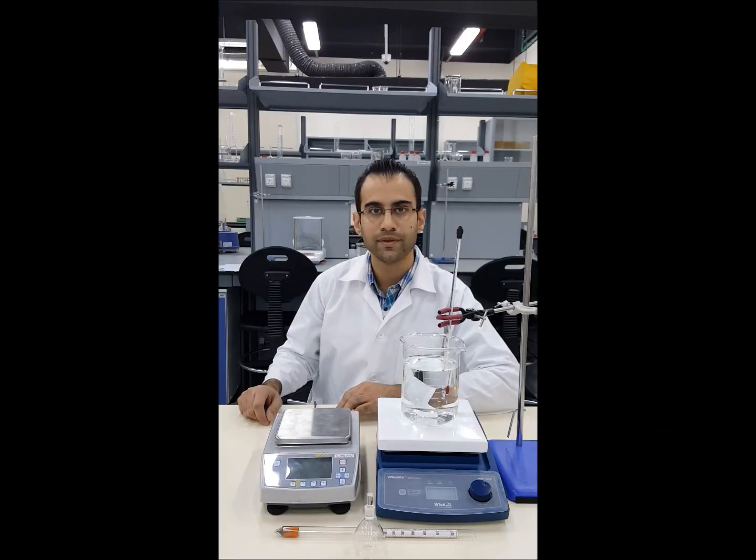Hello and welcome. This video will cover the water density measurement as a function of temperature.